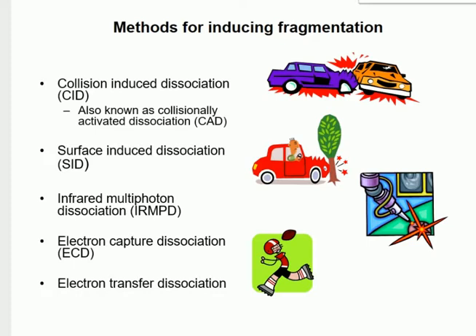So you need to have at least a doubly charged peptide that can capture or have transferred to it an electron. But as a result, you've got an unpaired electron, so you've got a radical species. Then you get some radical chemistry occurring, and so you don't necessarily get cleavage of the weakest bond. I'll show you that in peptides you get a cleavage of a different bond.